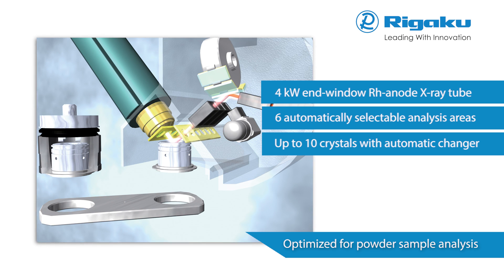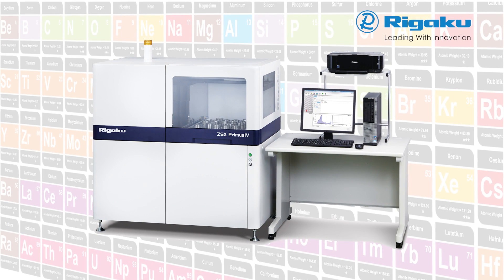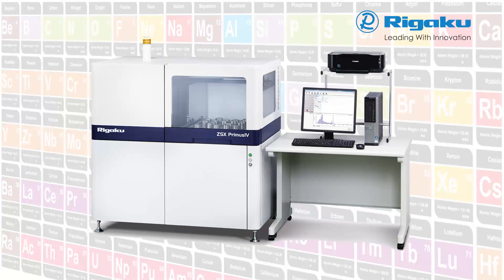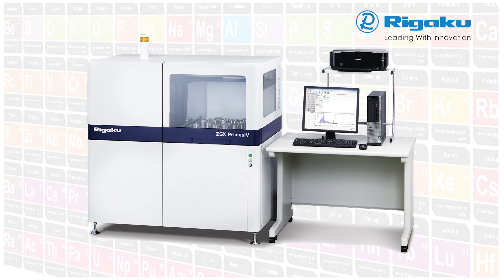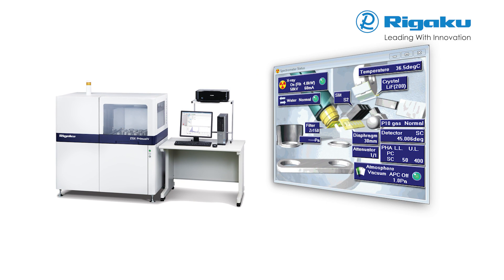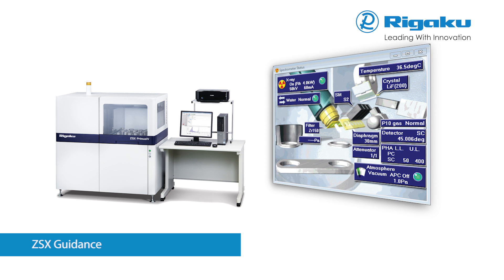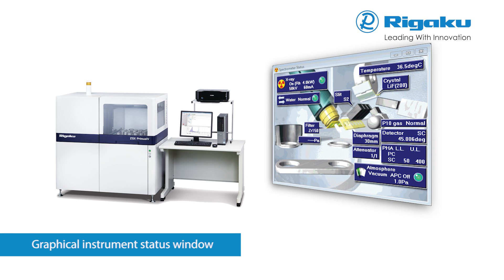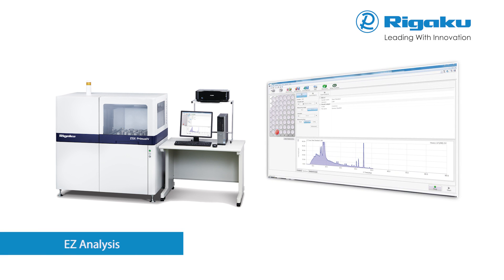The inherent design of the ZSX Primus IV contributes to maximum reliability and uptime. Rigaku has combined extensive experience in applications development and unsurpassed technical knowledge to create the world's best XRF analytical software. ZSX Primus IV features the new ZSX Guidance Expert System software with the built-in XRF know-how of a skilled spectroscopist. Another innovation is the graphical instrument status window for real-time display of key parameters at a glance. Easy analysis is a best practice design feature that makes everyday routine operation intuitive.